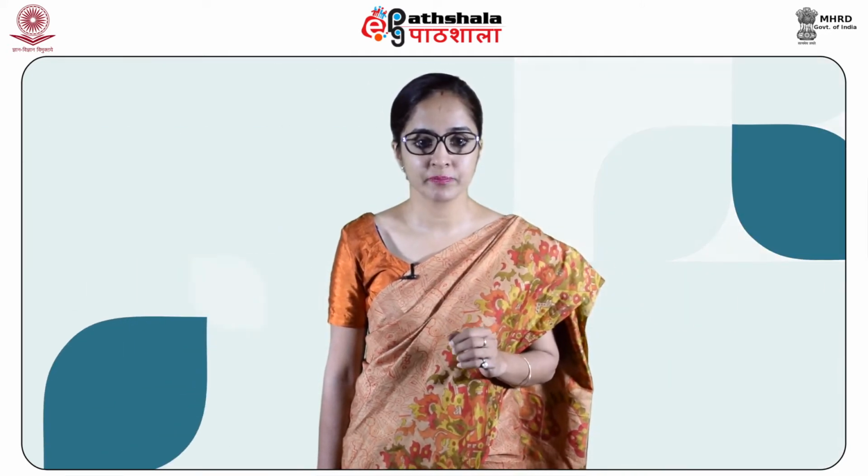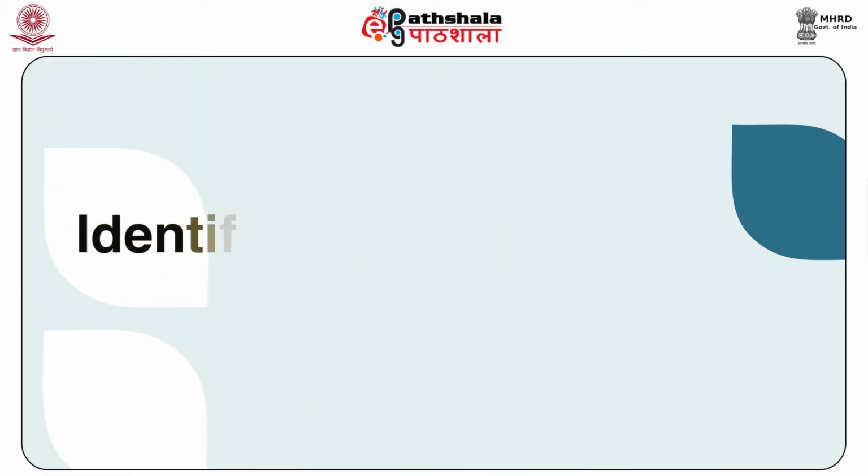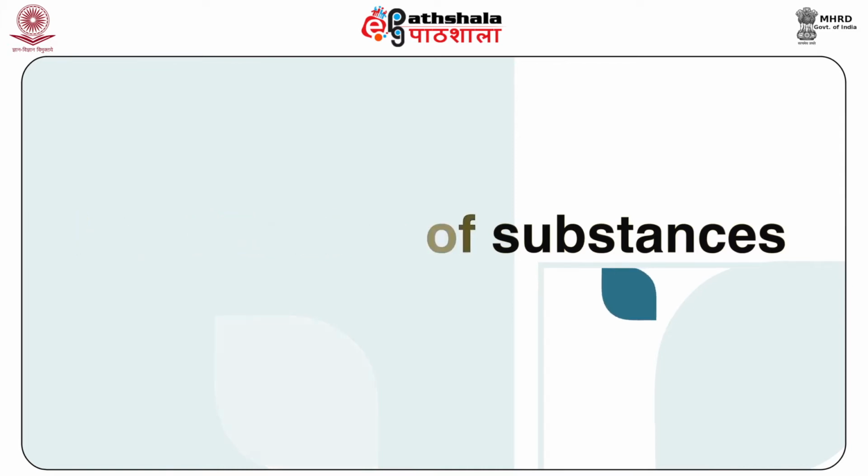The presence or absence of absorption in the carbonyl region, that is 1870 to 1650 centimeter inverse, or the hydroxyl region which ranges from 3700 to 3200 centimeter inverse, can serve to ascertain which of these possibilities may be present. It is thus possible to establish a correlation between IR absorptions and functional groups which may be present. Now let us get along with identification of substances as our next topic of discussion, students.